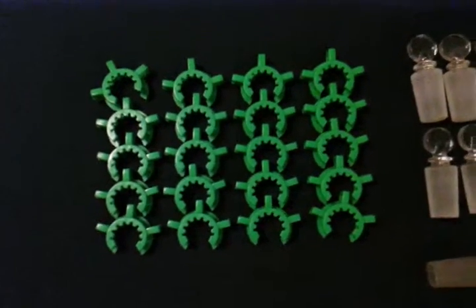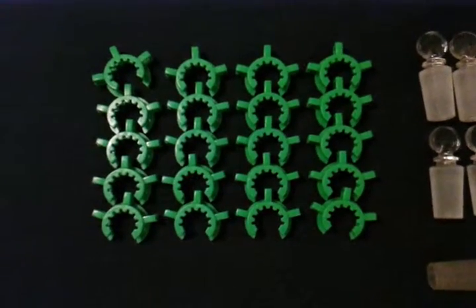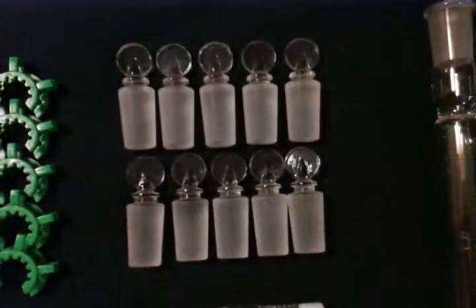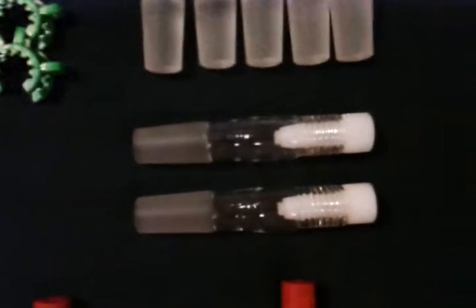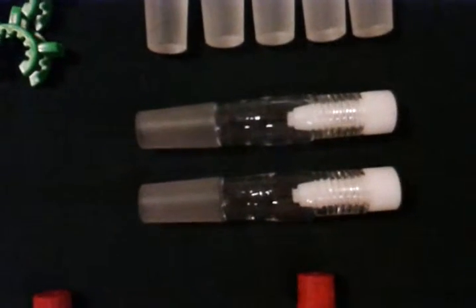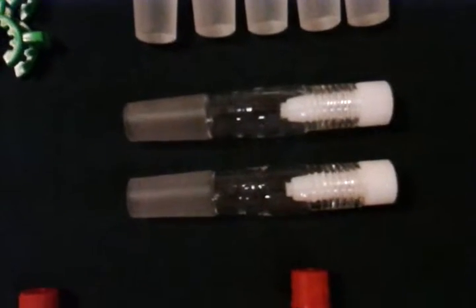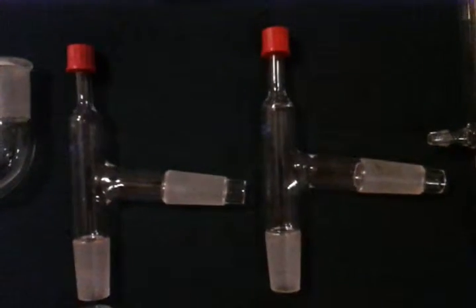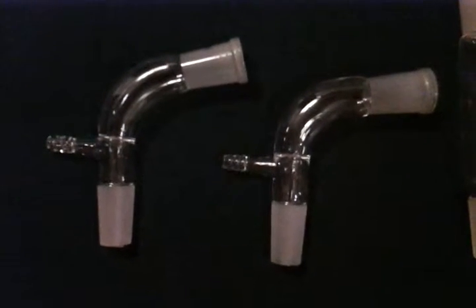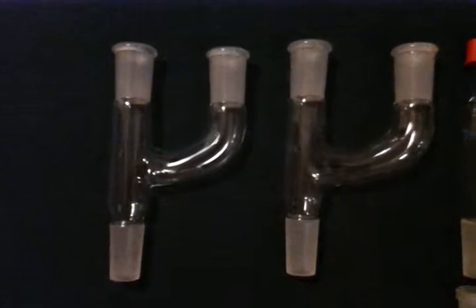20 plastic clips for 24/40 joints, 10 solid penny head stoppers 24/40, 2 24/40 thermometer adapters with nylon cap and O-ring, 2 24/40 3-way thermometer adapters, 2 24/40 3-way adapters, and 2 vacuum take-off adapters, 2 Claisen adapters.